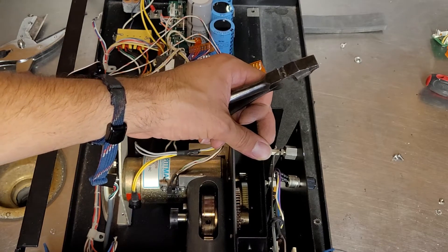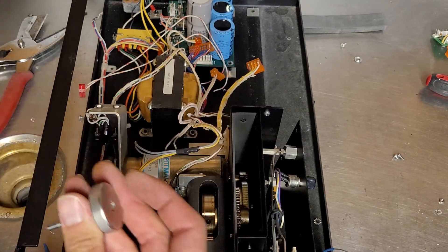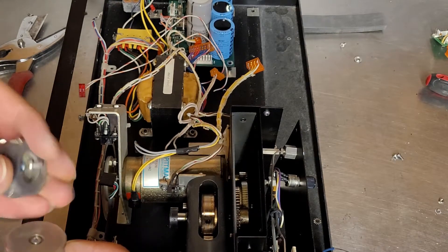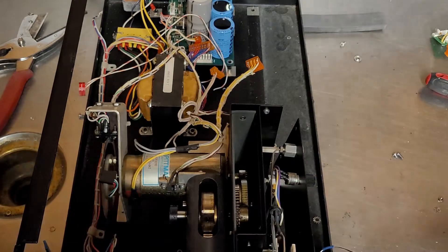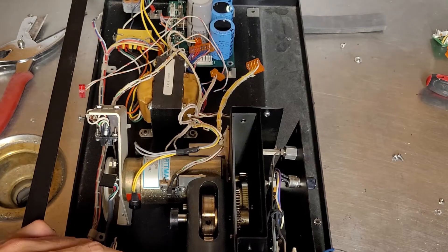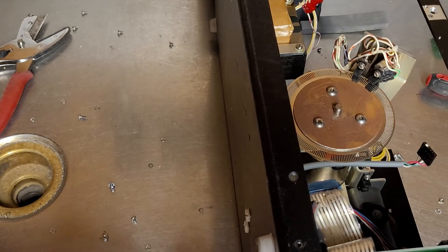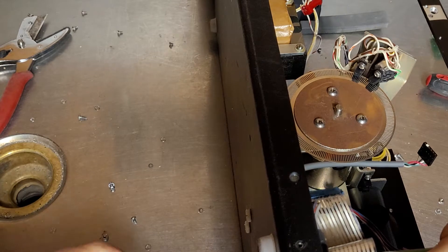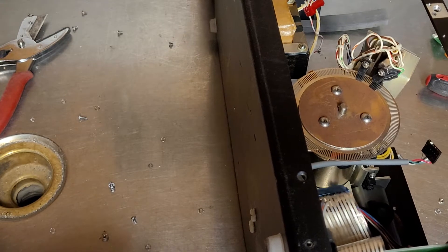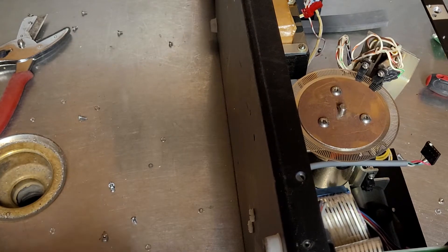Just trying to think of how to get this apart. Is this stainless? Seems to be. I think I have to be able to remove these screws on the bottom. They don't want to go counter-clockwise, but they'll go clockwise just fine.